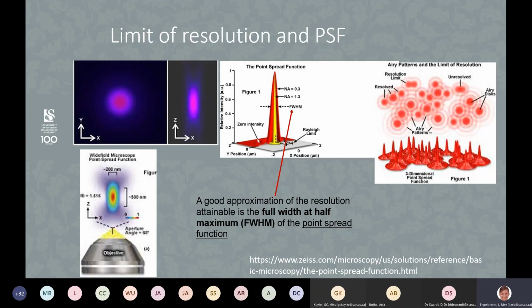If you look at a typical image, which you've stained with many different fluorophores, this is actually what it would look like. Luckily, we set the display so that we don't see these rings. We just basically see the middle, the peaks of the fluorescence. And if you put it as a function of intensity, again, you would have these peaks all around your image.